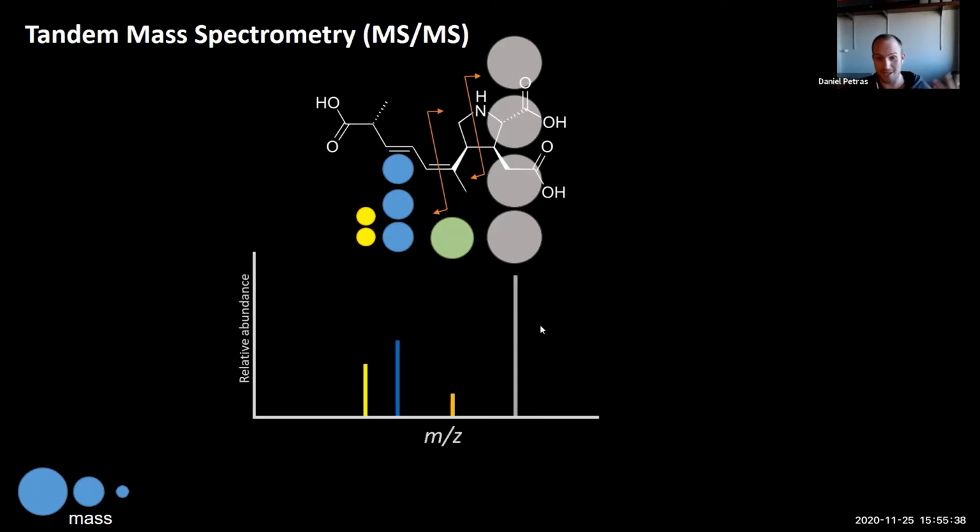And that to me is a tremendous increase. Of course, that needs basically all of you as a community to annotate the compound. So once you have published your new molecule, why not upload the MS2 spectra you acquired to this library and help others save months of their PhD work to solve the same structure as you have just published.